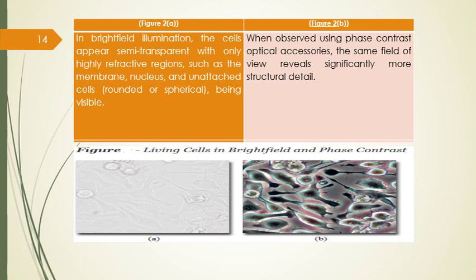image processing. So here I presented figure number 2, that is the comparison of living cells in culture imaged in both bright field and phase contrast illuminations. So actually these are the cells, human brain tissues grown in monolayer culture bathed with a nutrient medium containing amino acids, vitamins, minerals, salts, and fetal calf serum. So the cellular attachment becomes discernible, as does much of the internal structure. In addition, the contrast range is dramatically improved, as you see in the figure here.